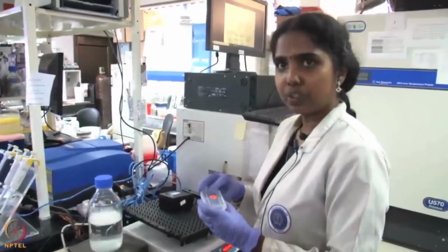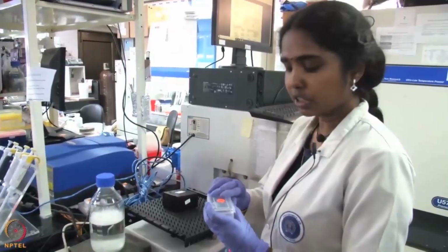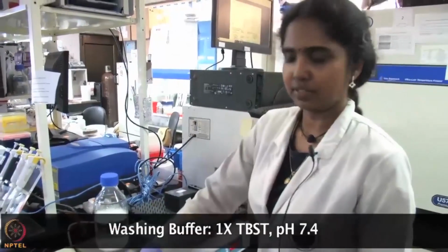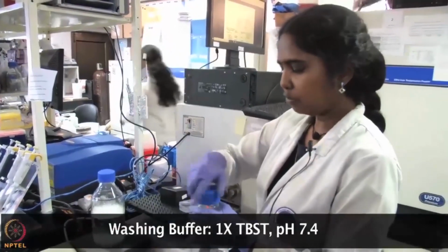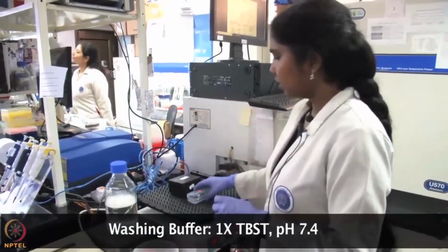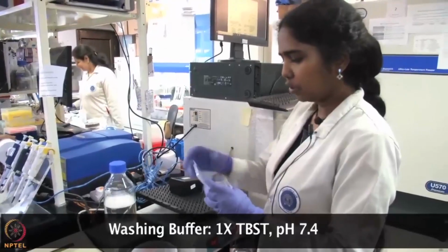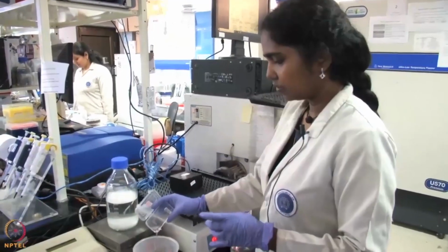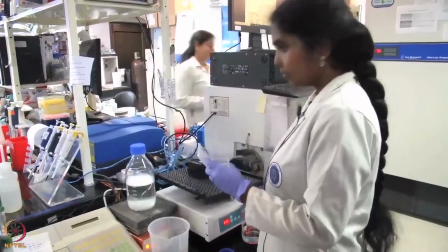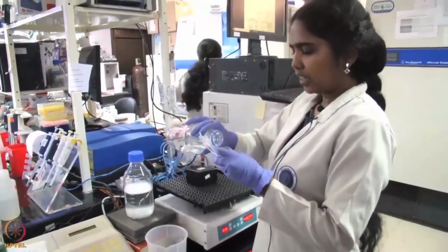After 2-hour incubation, we have to wash the solution. For that we are using 1x TBST of pH 7.4. First you have to discard the blocking solution. Then you add 1x TBST.